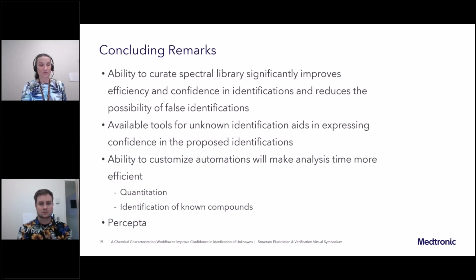And finally, for the identification of those known compounds, once the data is produced in our instrument computer, we're working on automating the archival of the data and having pre-processing steps take place behind the scenes, without any kind of chemist's intervention, so that when I come in the next day, all I need to do is pull up that data and review the assignments.